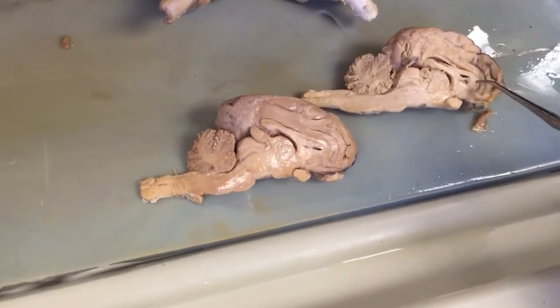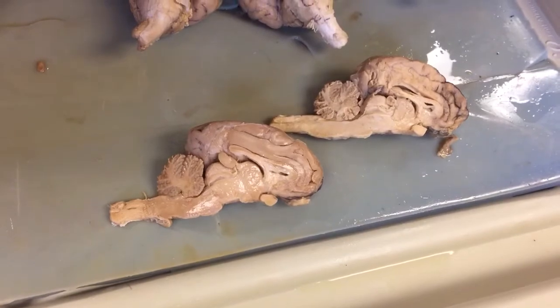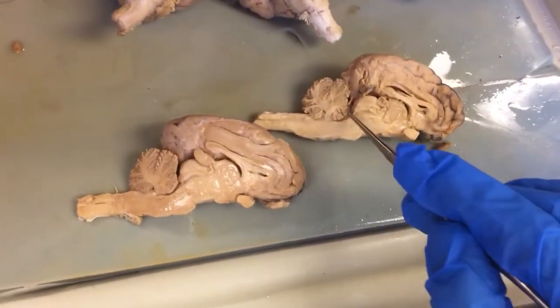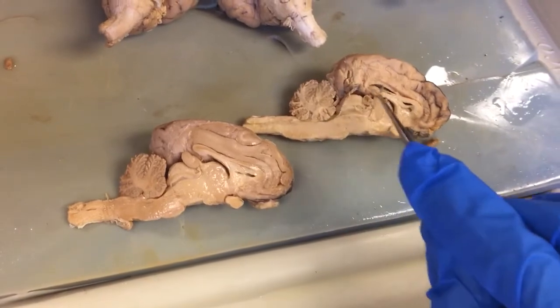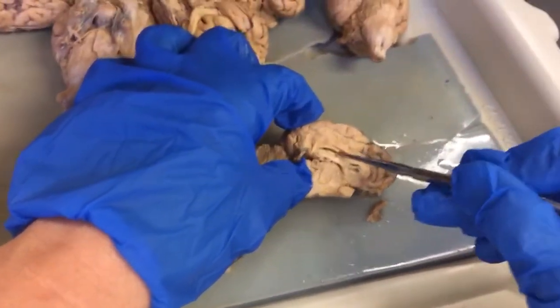Foundational knowledge in biology: there's a corpus callosum that connects the two sides of the brain, right? And then that has different parts. So you've got your cerebellar hemisphere, your cerebellum, you've got the different parts of your midbrain here, or like mid to hindbrain, and then you have your corpus callosum. And it's all folded back in there.